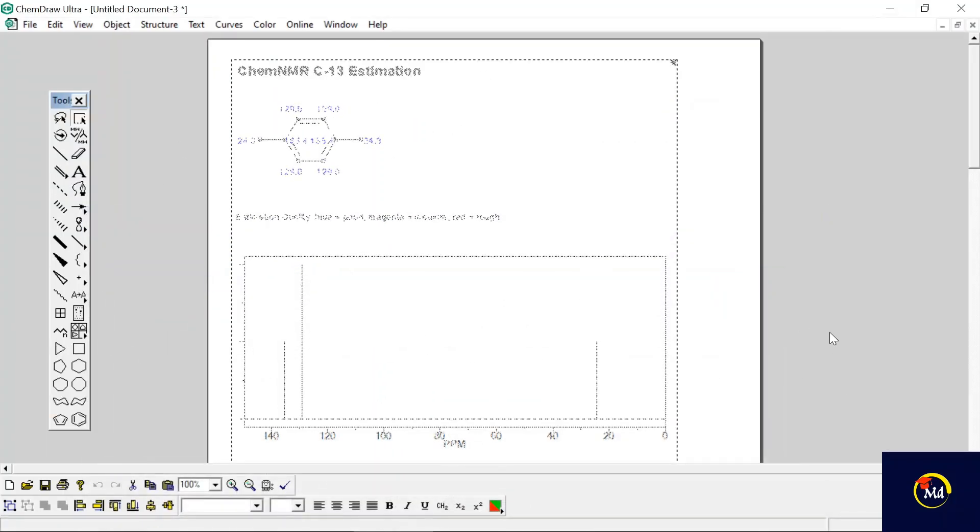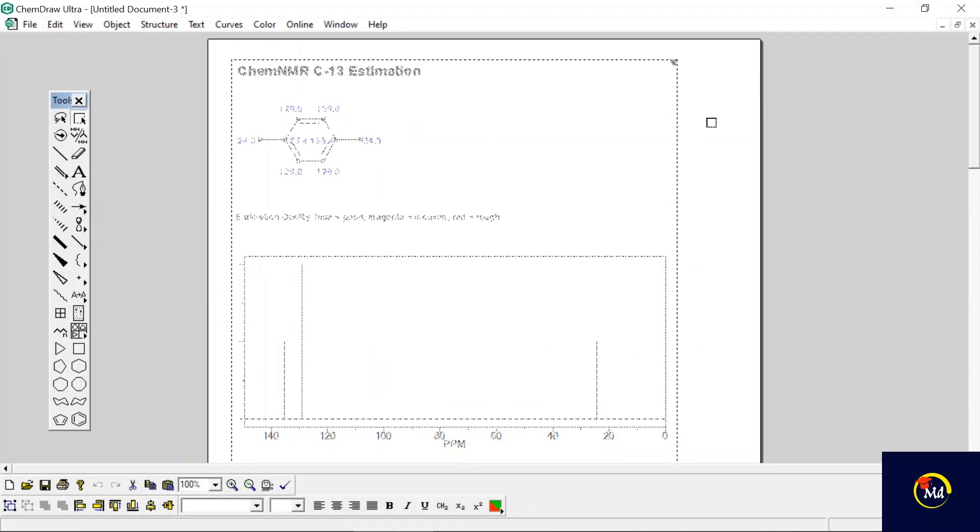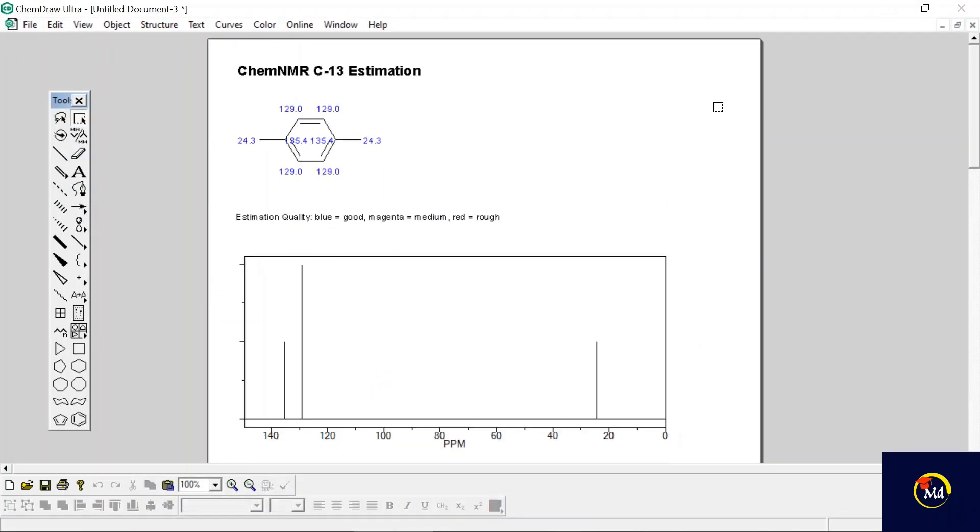These are the ways through which we can predict the carbon-13 NMR spectra or proton NMR spectra of any molecular compound. I hope this video is useful for you all.